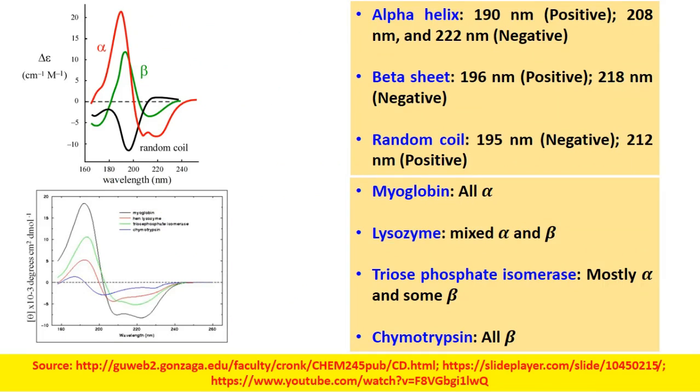Now, when you do CD spectroscopy for a protein, you get this kind of curves.